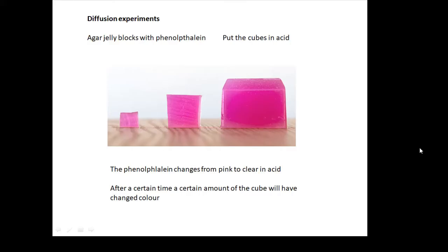So if I put these jelly blocks in acid, they will become clear because the indicator will turn from purple to clear. After a certain time, all of the cubes will eventually change color and become clear. There won't be any purple anymore.